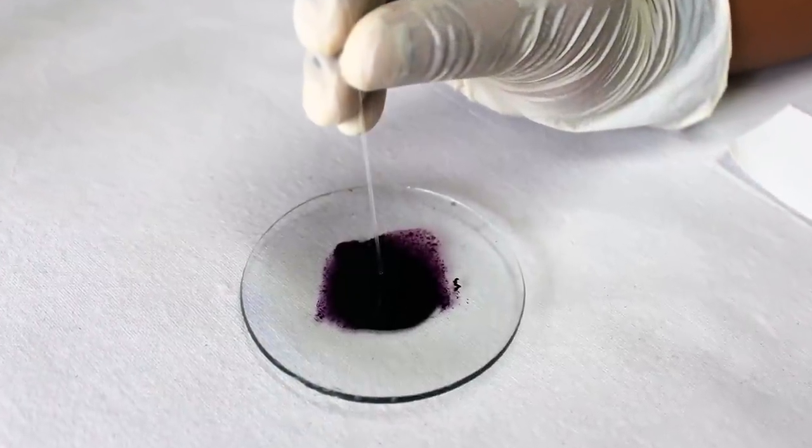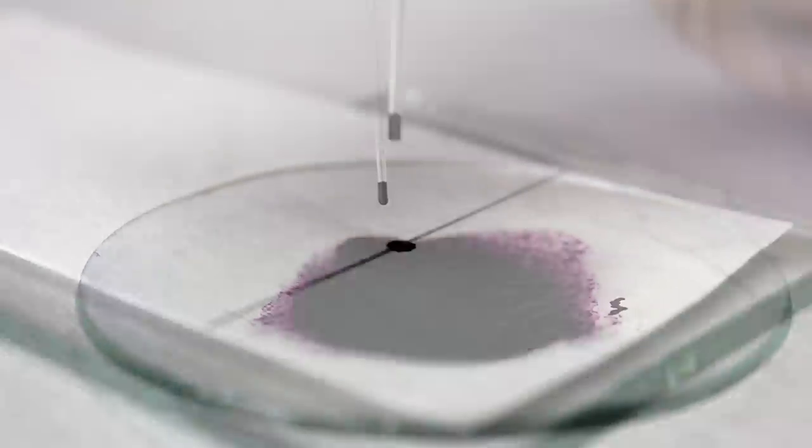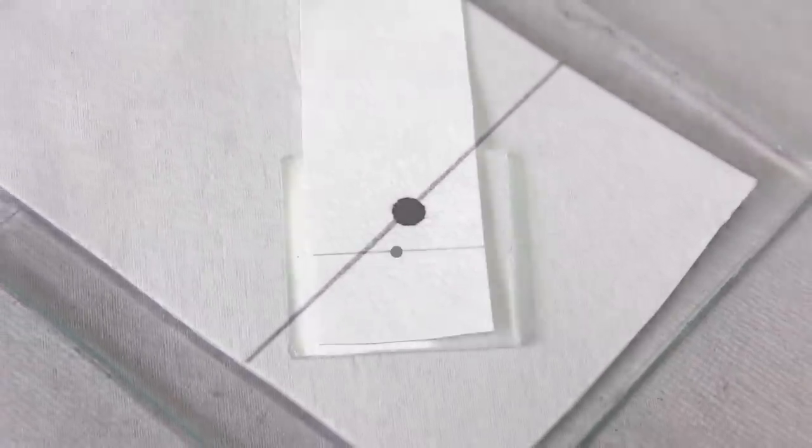Again, take the mixture of red and blue inks using the capillary tube. Put another drop on the same spot and dry it again so that the spot is rich in mixture.